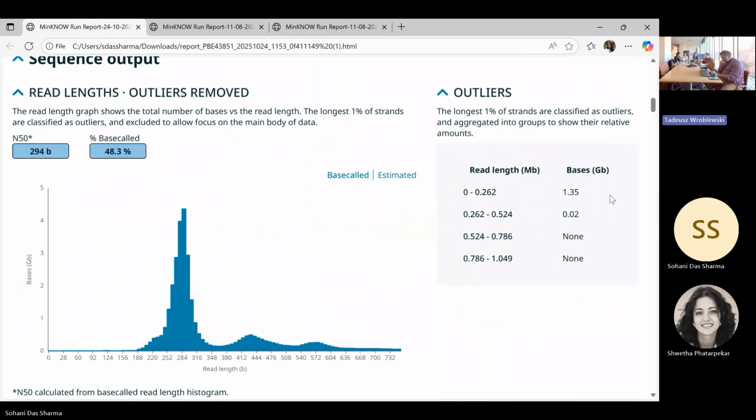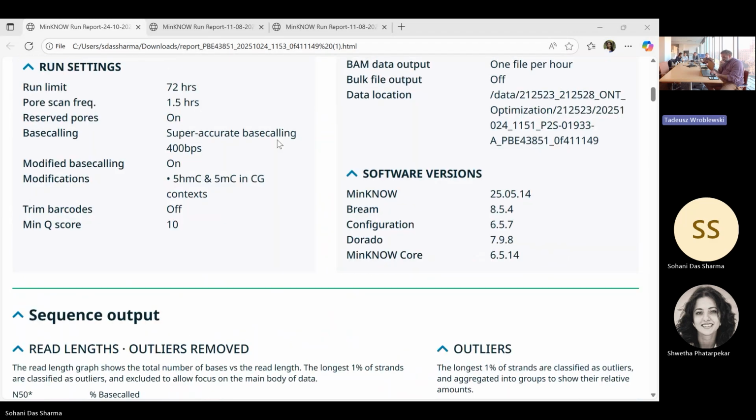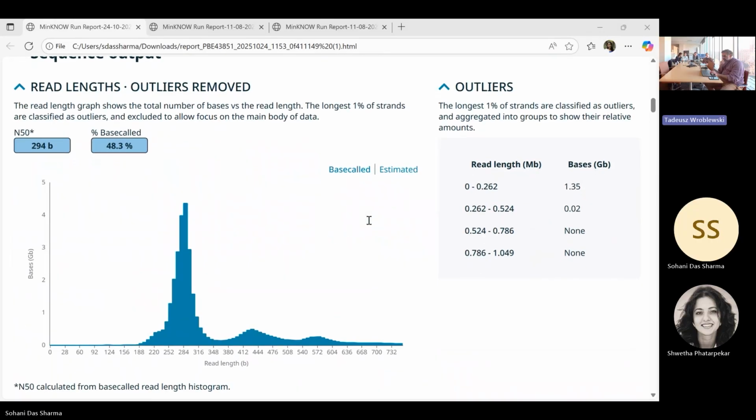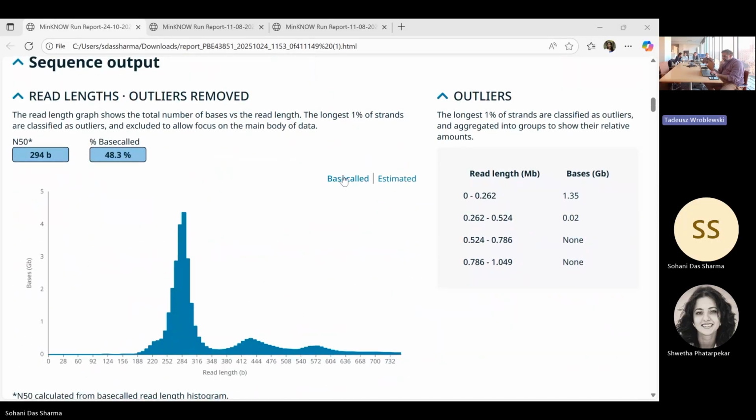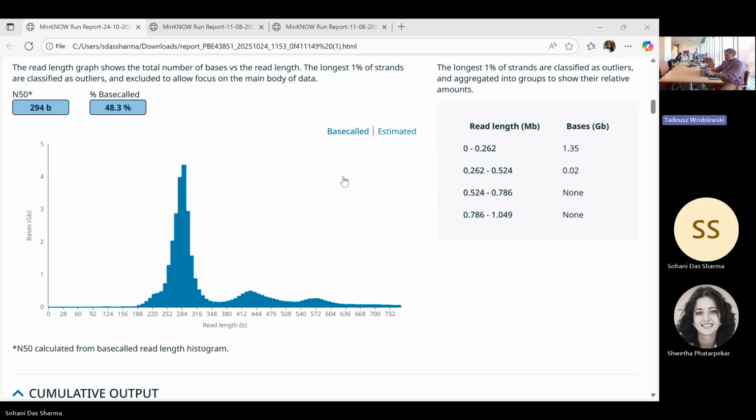Yeah, this is one of the cfDNA sequencing reports I obtained from a different lab. It is not CSF, I know it is plasma. I don't have any other biological information available, but I think it is quite identical to what you are saying, kind of 3 peaks, right?